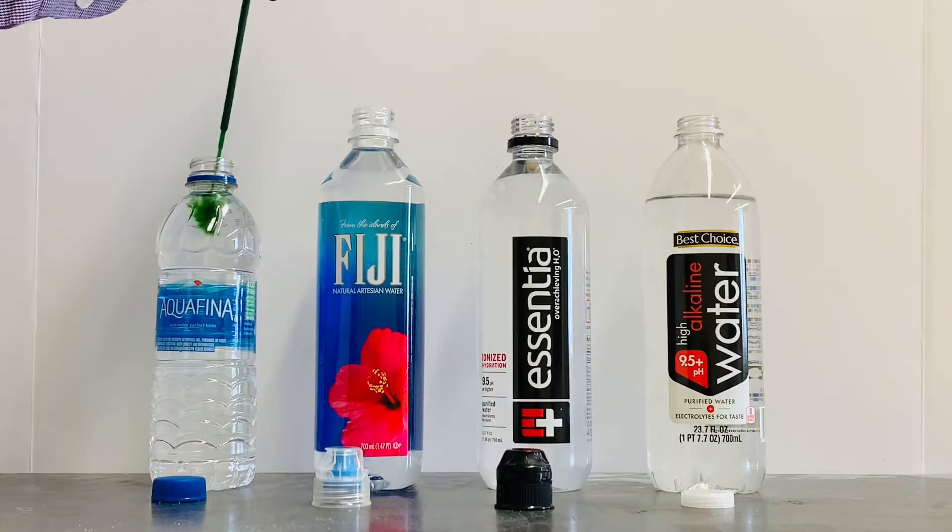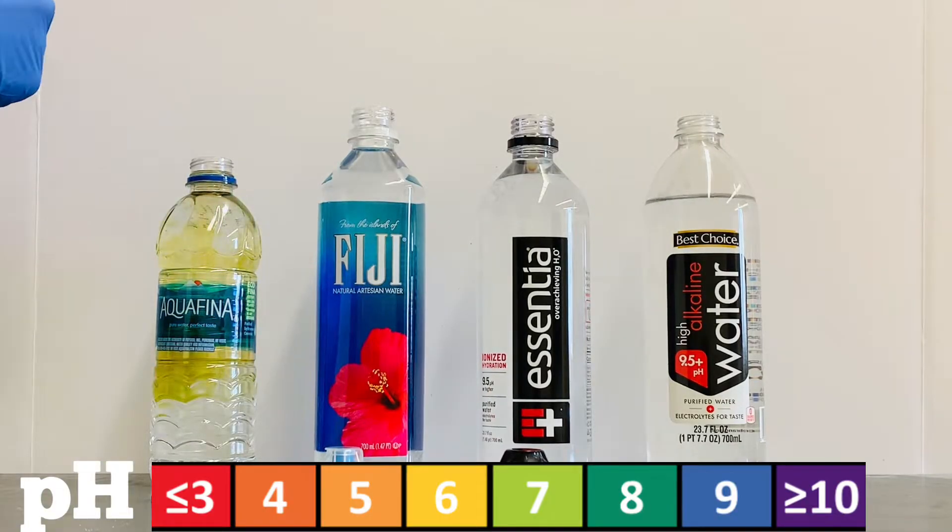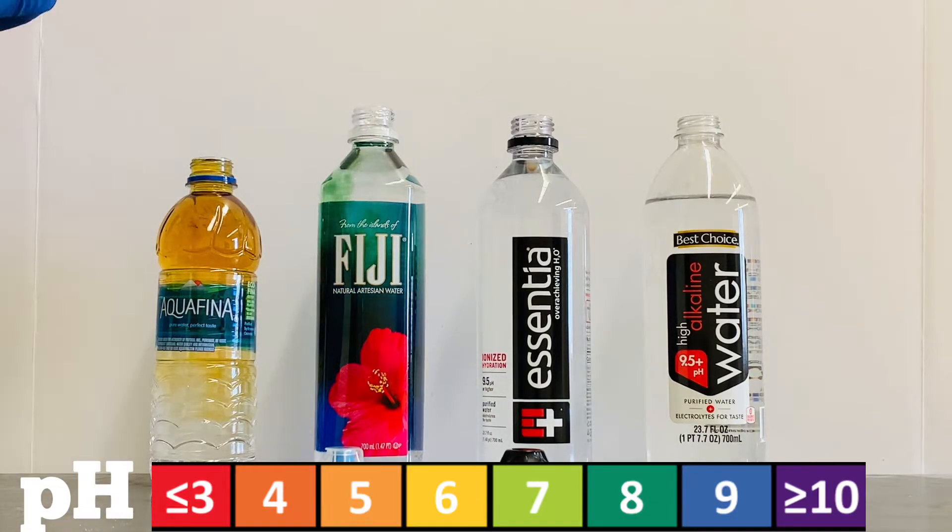As you can see the Aquafina turned a nice yellow color, indicating that it's just slightly acidic. On the other hand, the Fiji water turned a nice green color, which tells me that this water is just a little bit basic.